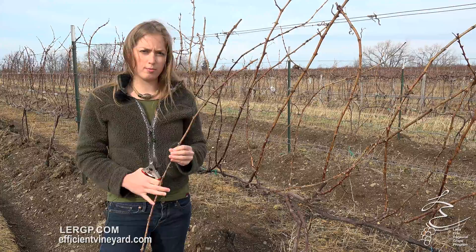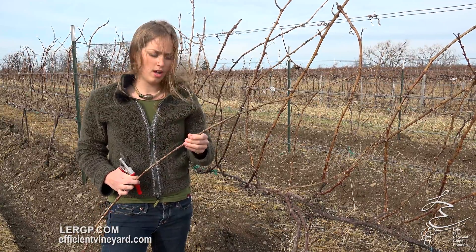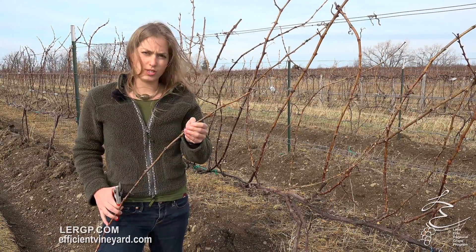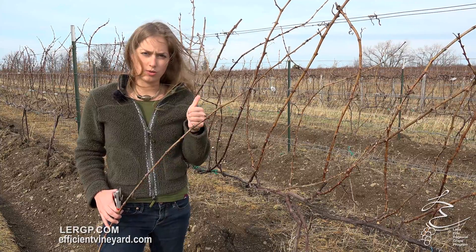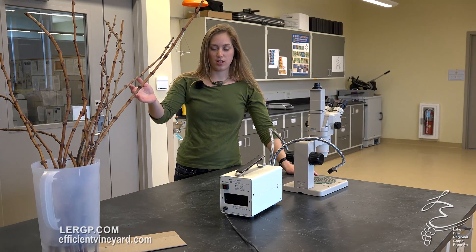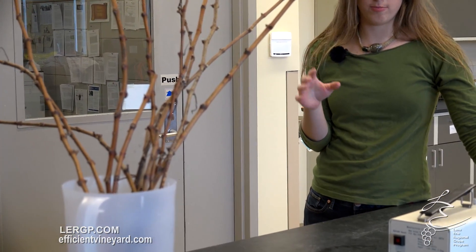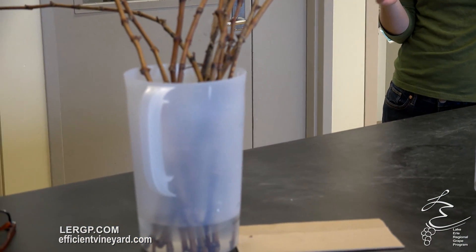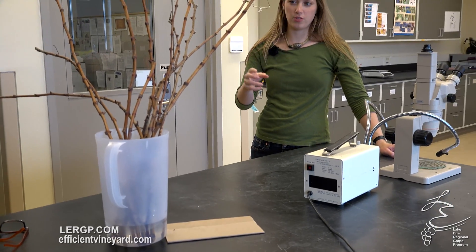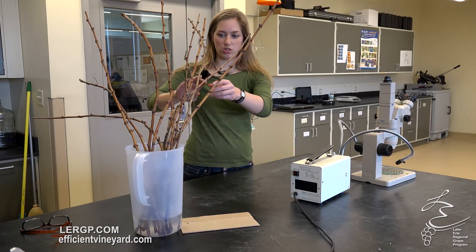We'll take these inside and be able to dissect them. We're going to grab the rest of our samples and meet you in the lab, where we'll start cutting into these buds and take a look at what kind of mortality we saw from that cold event this year. Here we are in the lab with our samples. You really want to make sure that they've been soaking in water at room temperature — two days is probably good. You want to give time for the tissue that is dead to oxidize, which makes it easier to actually dissect the buds.